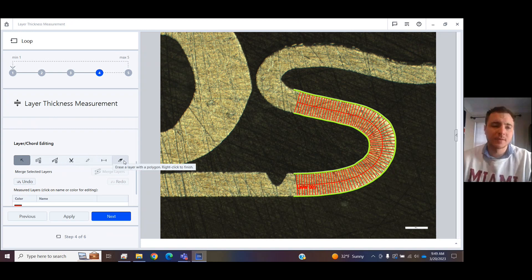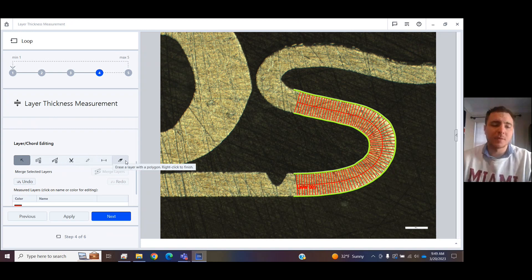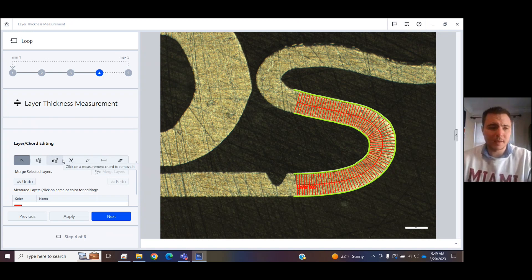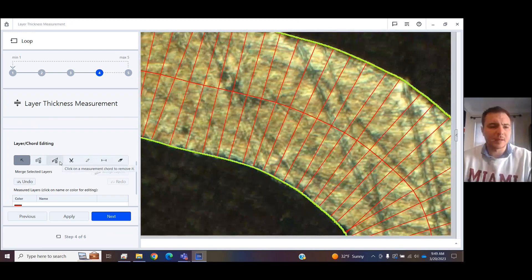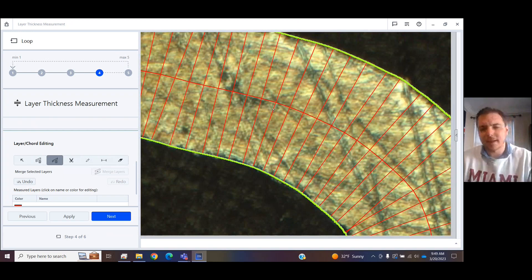You can also erase or edit some chords. If you have multiple layers, you can control and select them. And then you should be able to merge them together right here. But it was able to find the entire layer, as we can see right here. I could edit or remove a chord if I didn't want it added, if there was something strange about it.